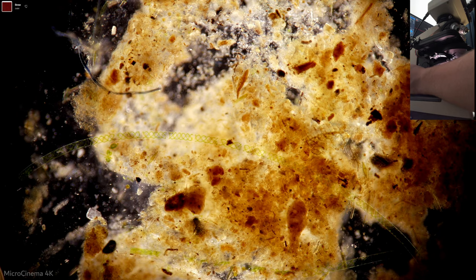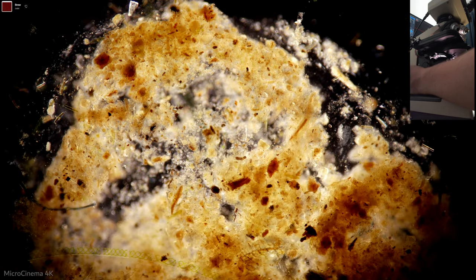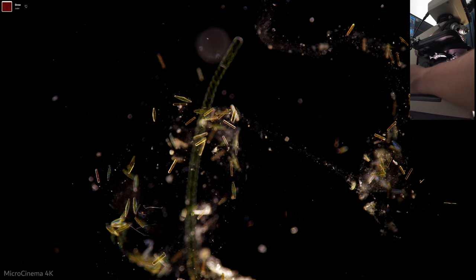Now you might notice there is a little bit of vignetting with the 4X. And I think that's just kind of normal for the 4X. Even in bright field, there's a pretty good kind of tapering off as you go towards the edges of the image.